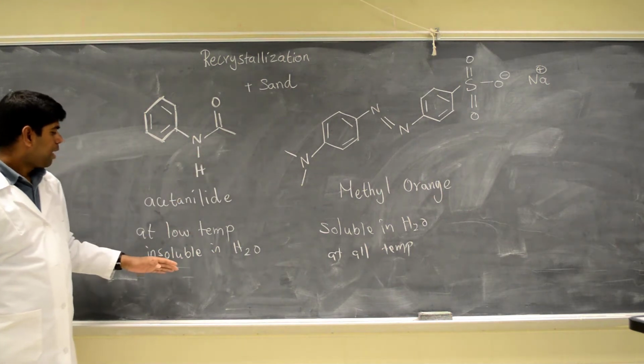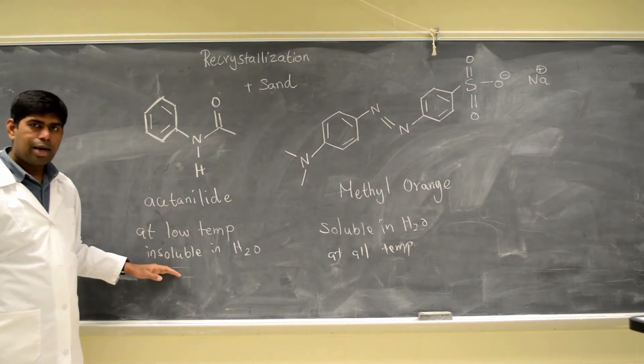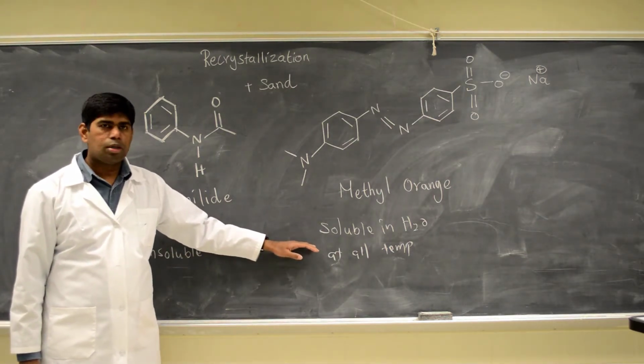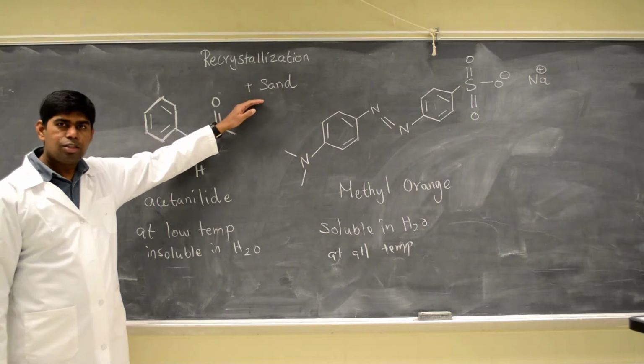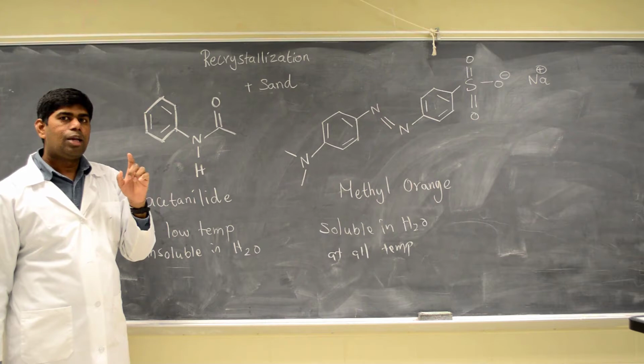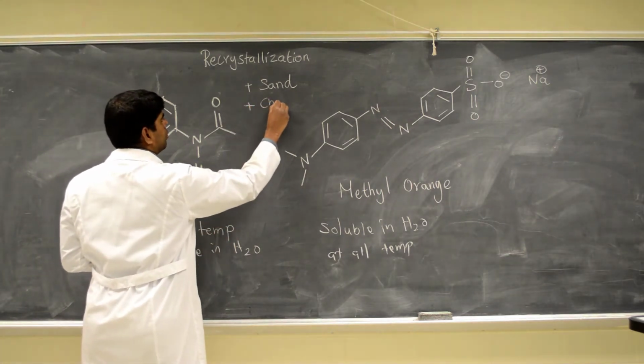Here we have acetanilide, soluble in water only at a high temperature. Methyl orange, soluble in water at all temperatures. Sand, insoluble in water at all temperatures. And I'm going to add one more substance, that is charcoal.